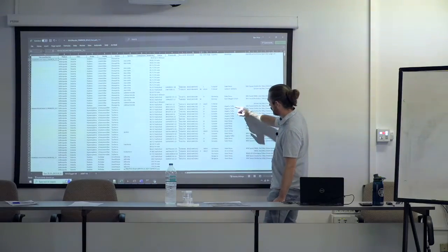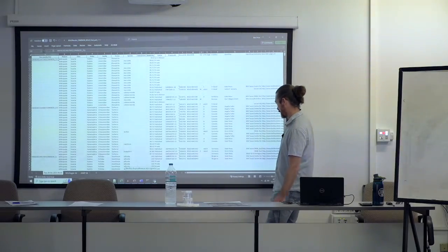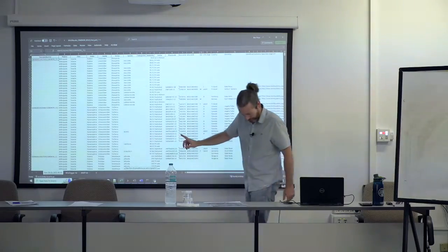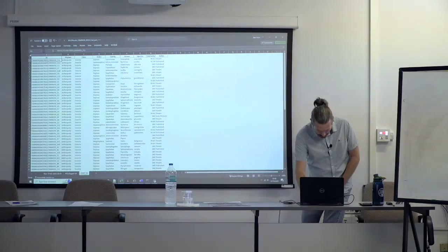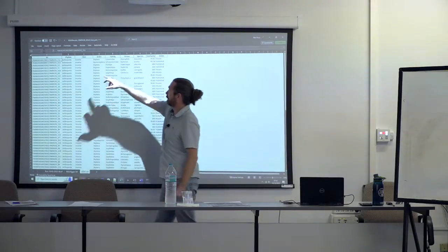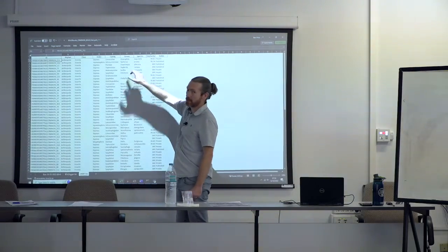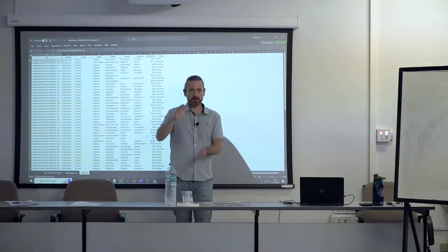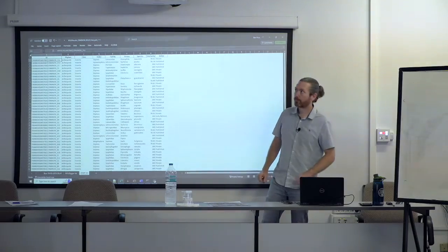But I think Angela works at BOLD, so maybe there's an issue with the country for that. But yeah, the interesting thing is you can actually see, oh yeah, there is one species. And if I remember rightly, if I do the JAMP hit for G12, yes. So the JAMP hit has said for this record that we only got a genus level identification later. It says there's a 99.74% identification at that species. The other ones aren't identified as species, so I'm not going to use that as a reason to not give you a species ID. Can you get more than 20 records for each?